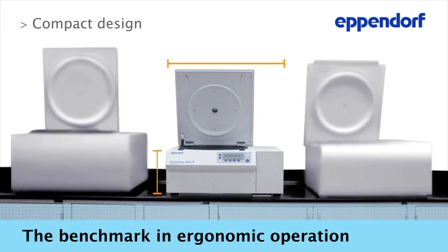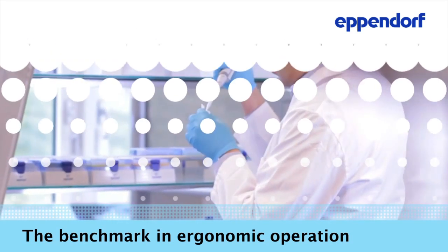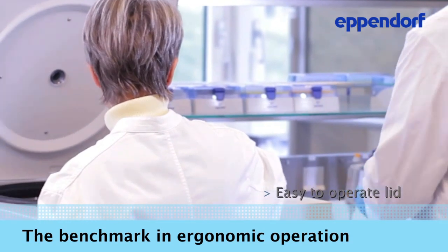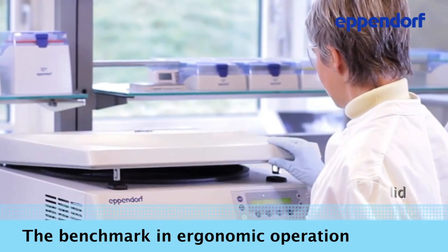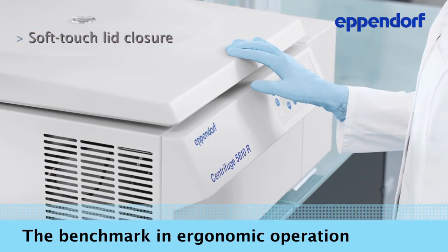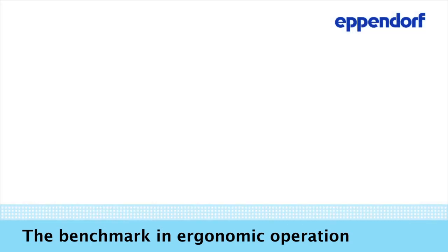This not only saves you valuable bench space — the exceptionally low profile of our centrifuges also makes loading and unloading of the rotor simple and easy. There's no need to exert unnecessarily high force when closing the centrifuge lid. The soft touch lid closure allows closing the centrifuge with ease.